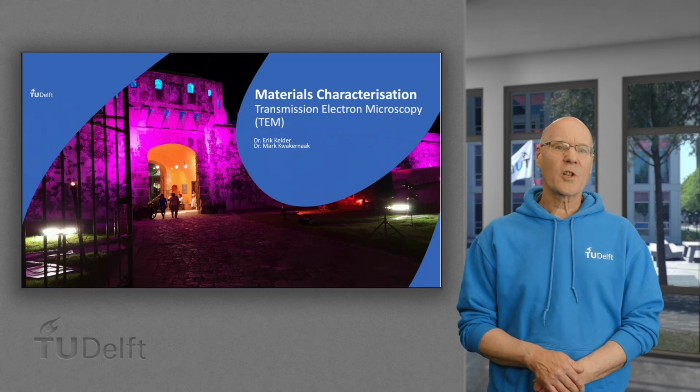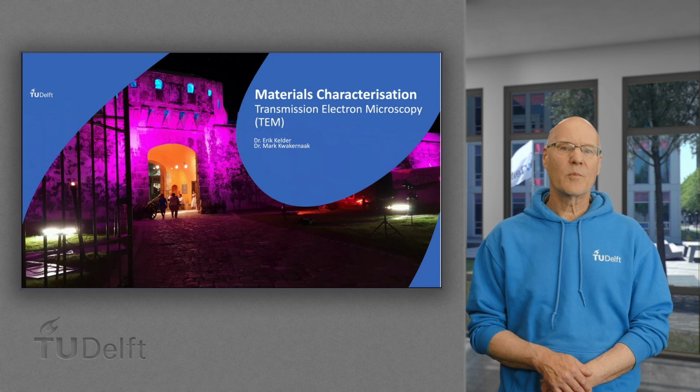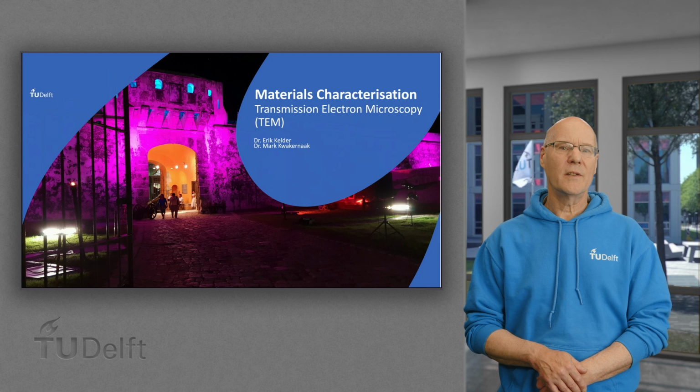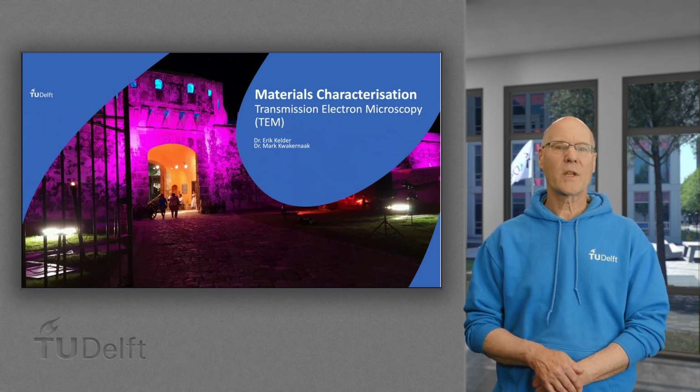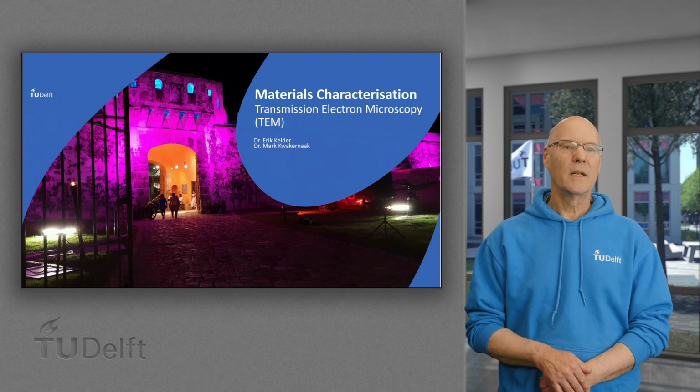Scanning electron microscopy (SEM) gave us nice details on the morphology of certain materials. In some cases we want to see more details that cannot be seen with SEM. In that case we must use transmission electron microscopy (TEM).